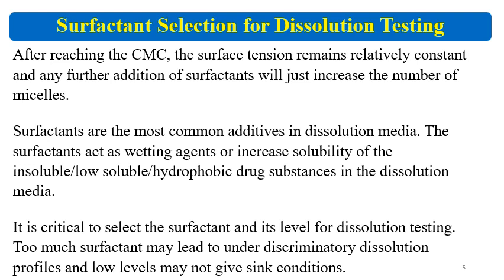This is the reason why surfactants are proposed to be used at CMC concentration. Sometimes if the drug molecule gets solubilized before reaching the CMC, that is also fine, but using the surfactant above the CMC level is not recommended, and if it is required, then a strong justification should be there.